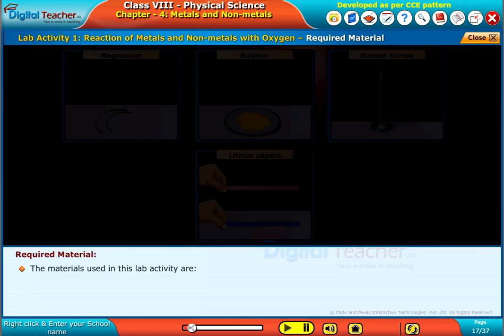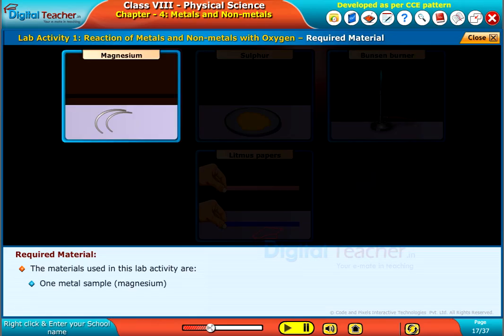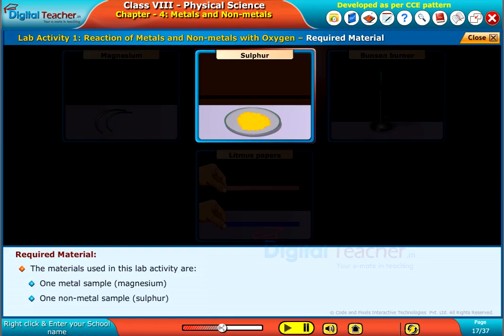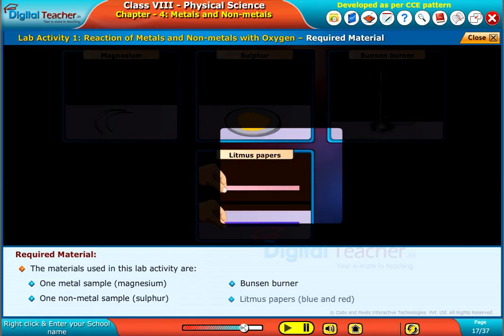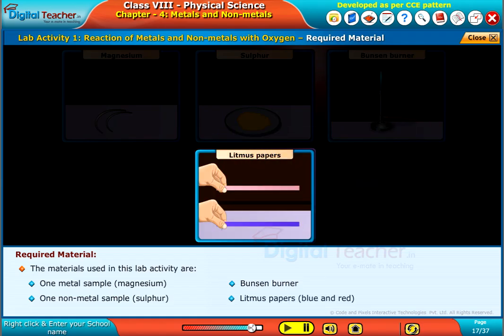The materials used in this lab activity are: one metal sample — magnesium; one nonmetal sample — sulphur; a Bunsen burner; and litmus papers, both blue and red.